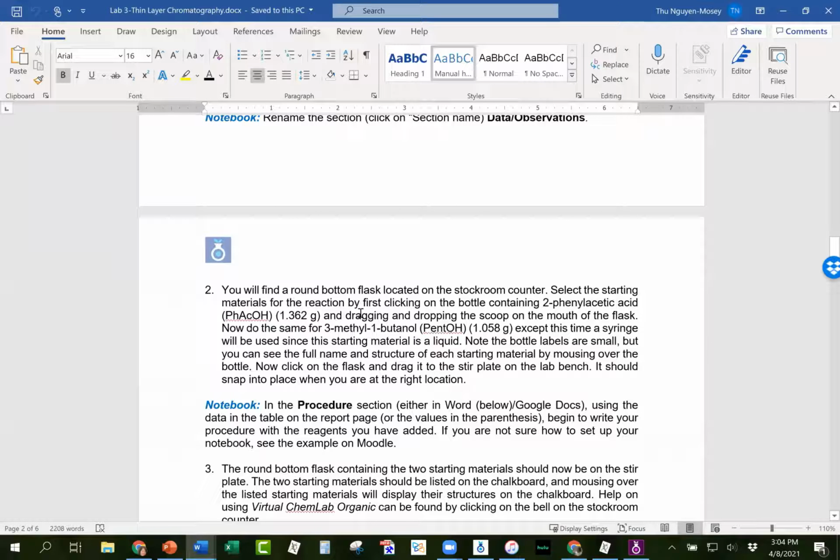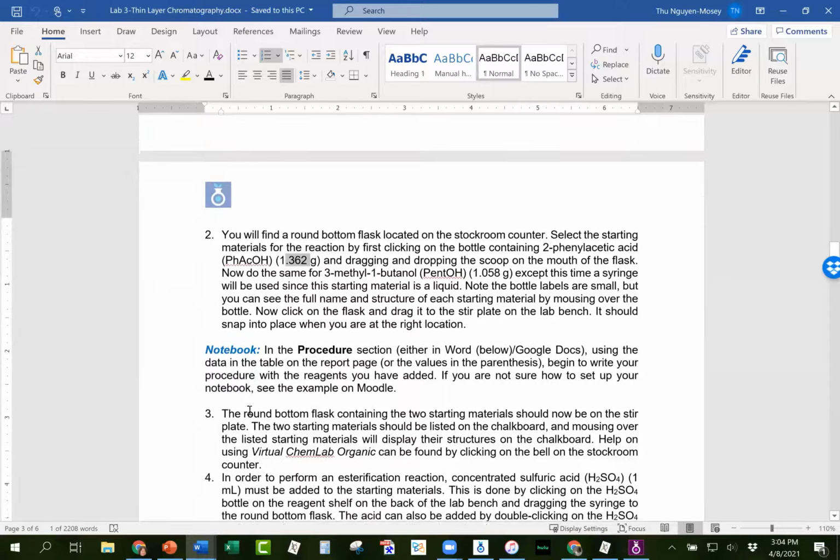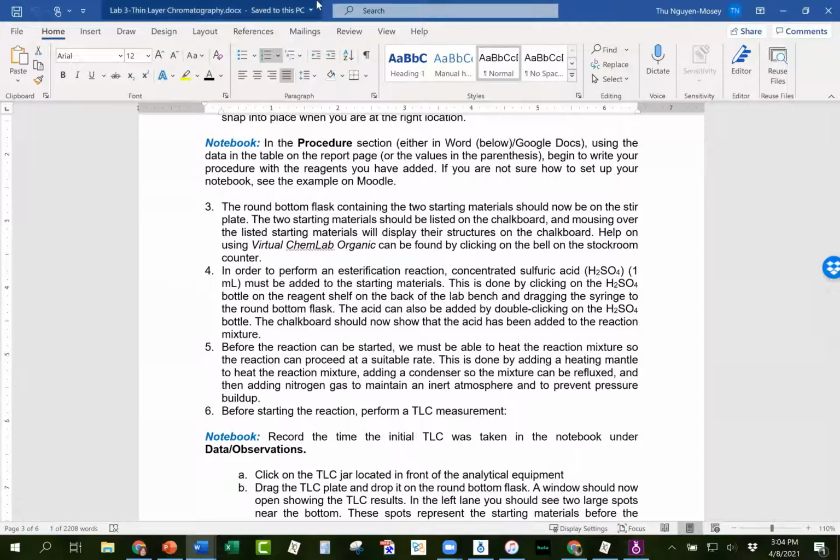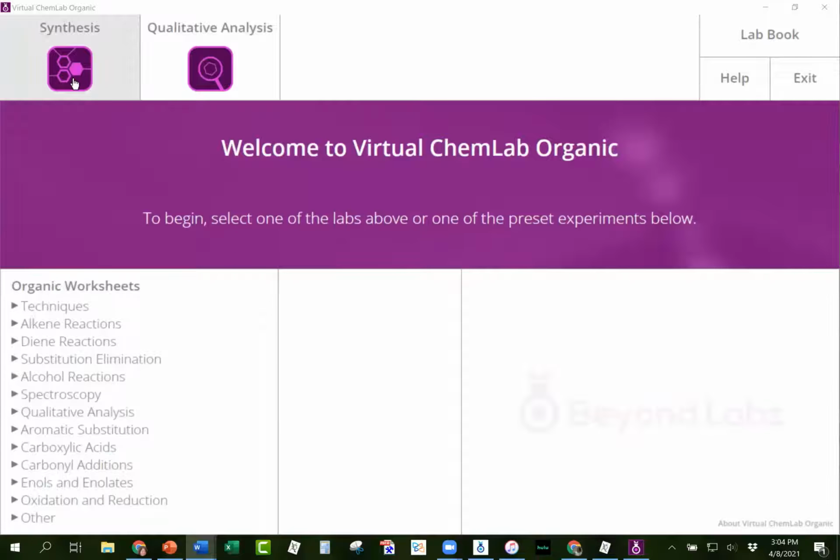In a regular organic setting, we have them write these detailed instructions. So I have things like the grams that they're pretending to use that they don't actually weigh out, but then they're asked to calculate yields later on in their lab procedure. I have cues for them where they need to do things in their notebooks or with questions or where they need to add things there. But mostly they enter the organic lab through the synthesis window.